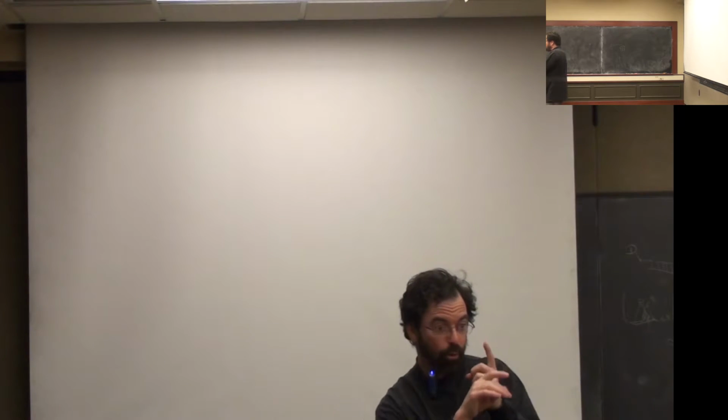But how good is this approximation or model, because this assumes that things are static, that the donor is sitting at a particular position. In fact, it may be wobbling around. So how are you going to tell if it's wobbling around during its lifetime? And that is where the polarization or anisotropy comes in.